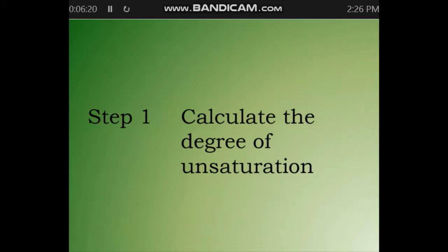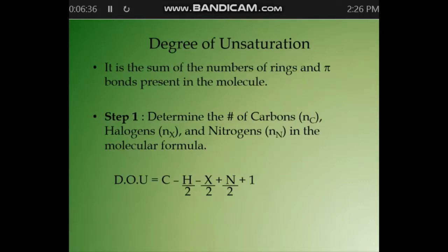So how do we analyze the IR spectrum? When you have the IR spectra and the molecular formula of the compound, first you need to calculate degree of unsaturation.